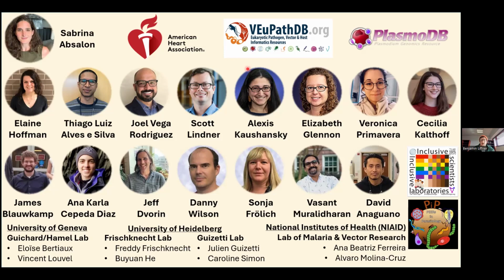But for those guys, I've actually decreased the gel volume quite significantly, which makes the gel much thinner. So in a practical sense, that's meant that on one of the two sides of the gel, even on, say, a 63x or a 40x objective, I should always be able to access enough of the tissue that I can get the images that I need.